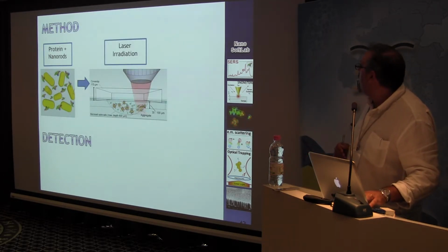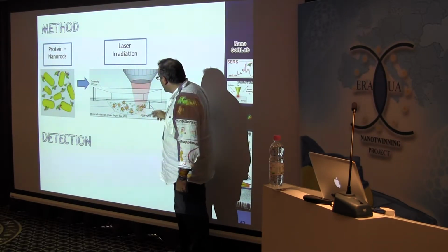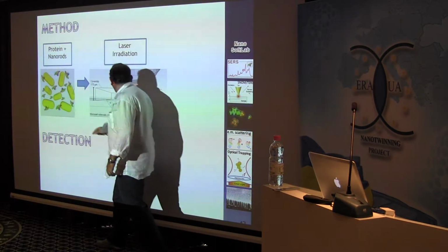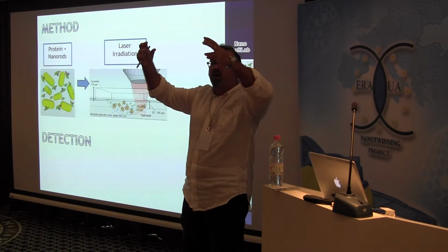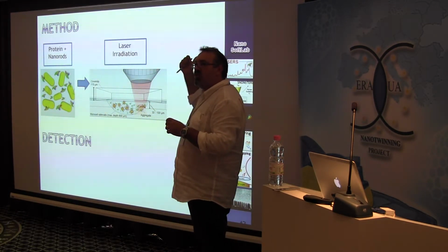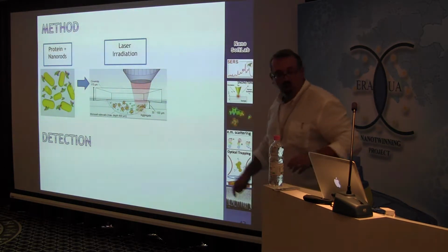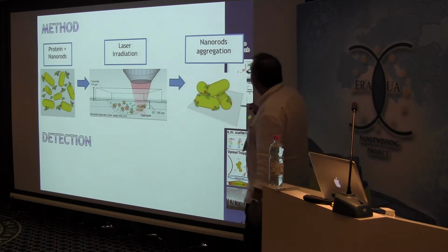In the other case, if you start irradiating with laser light and you use this kind of sample chamber, you can push, by optical forces, all these nanorods toward the bottom, where they aggregate. So you pass from a condition of individual nanoparticles to a condition of coupled nanoparticles. And that's what we have been shown before. When you have coupled nanoparticles, the field enhancement is much higher. And this, as I will show you, provides SERS from the molecules that are lying in the hotspots.